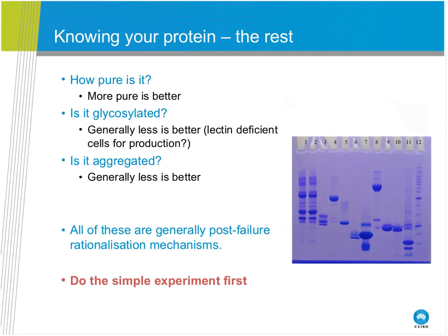This particular gel I'm showing here is a gel of the samples that came in recently into C3. We run a protein gel of all of our samples. We put these up on the web for everyone to see. However, we only identify them by sample ID, not by the person who made them. Now, I would look at these and I would say there are some lanes of protein here that I would not at all be surprised if they don't work too well.